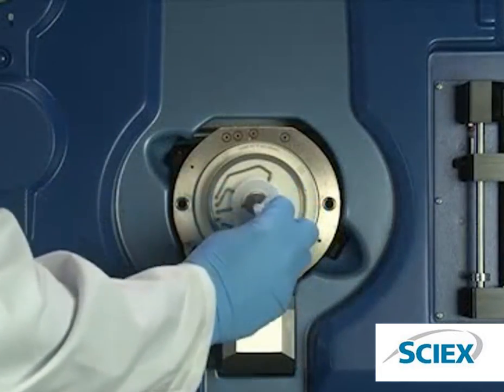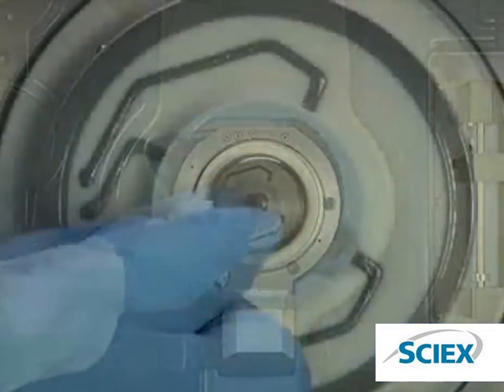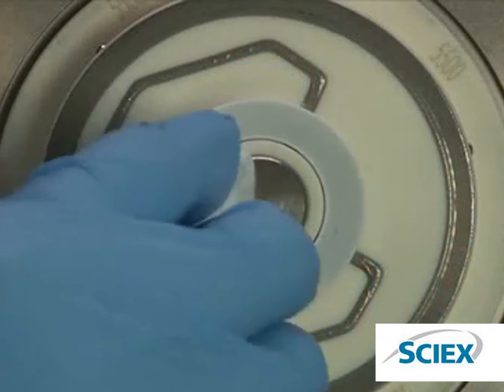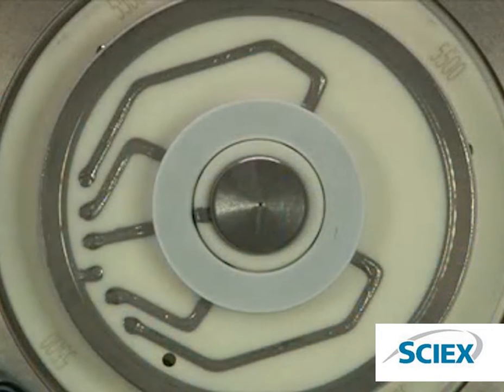Dampen a lint-free wipe with water and wipe the front of the orifice plate. To avoid tissue fibers entering the mass spectrometer, do not rub the wipe over the orifice in the center of the plate. Repeat using the cleaning solution. Wait for the orifice plate to dry.